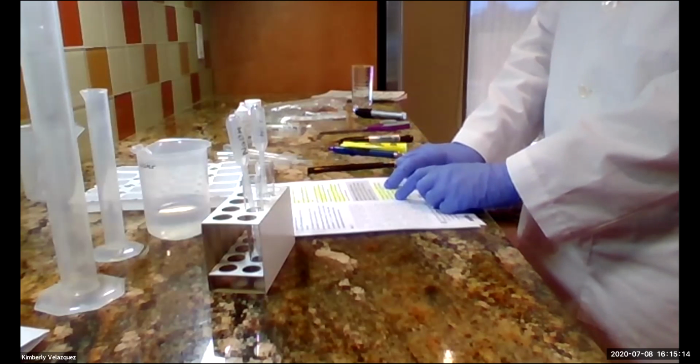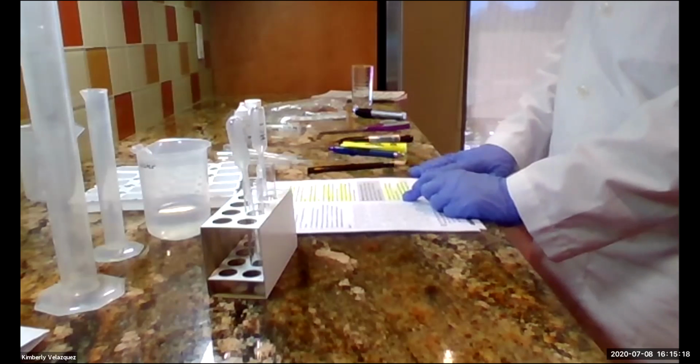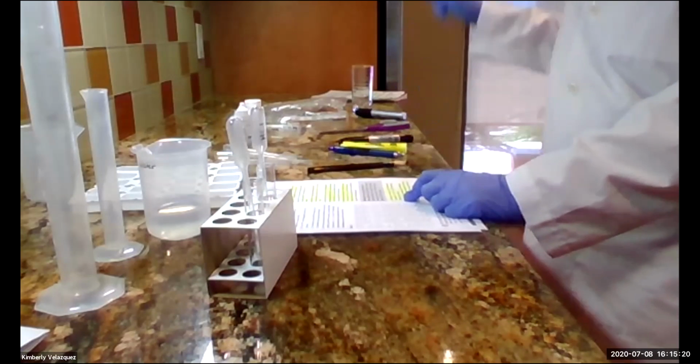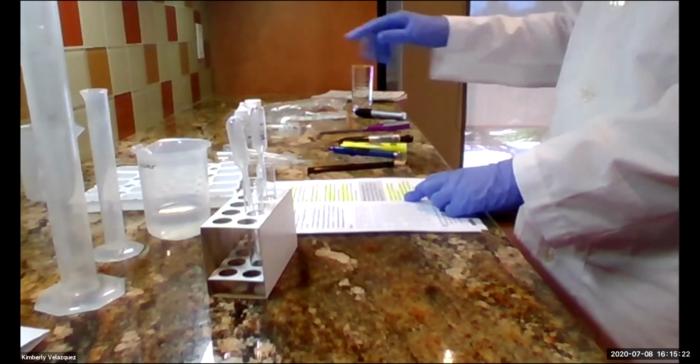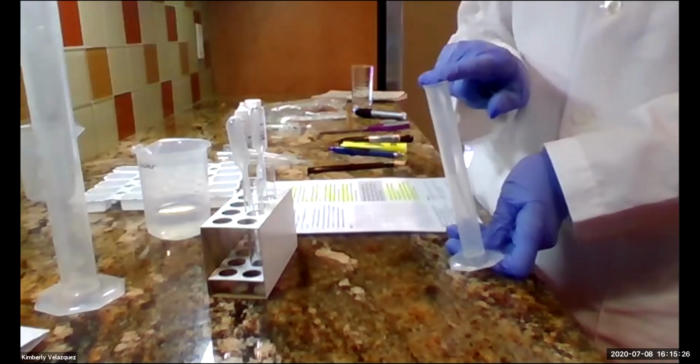You also now want to prepare these two solutions. In order to prepare those two solutions, you're going to have to use the calculation that you had before. So you're going to need your small graduated cylinder.